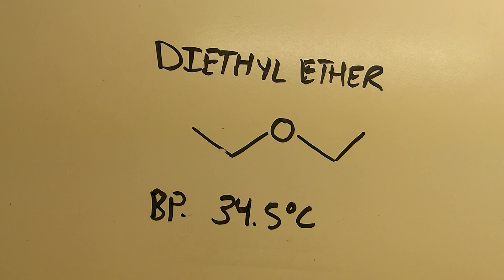Hi everyone and welcome back to the lab. In this video I'll be distilling diethyl ether from a store-bought product. You can actually make diethyl ether using the dehydration of ethanol with sulfuric acid or something, which is good for pedagogical purposes I suppose, but it's way too expensive to do it that way. I'll demonstrate that dehydration reaction of alcohols in a later video.